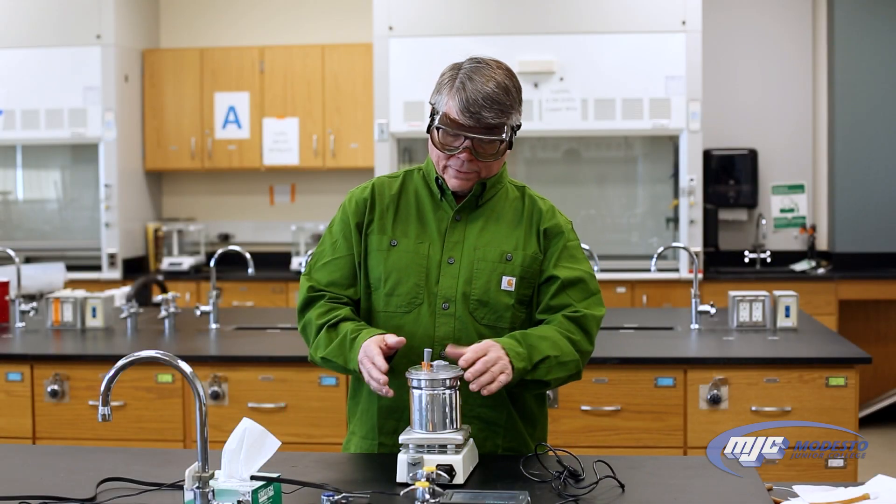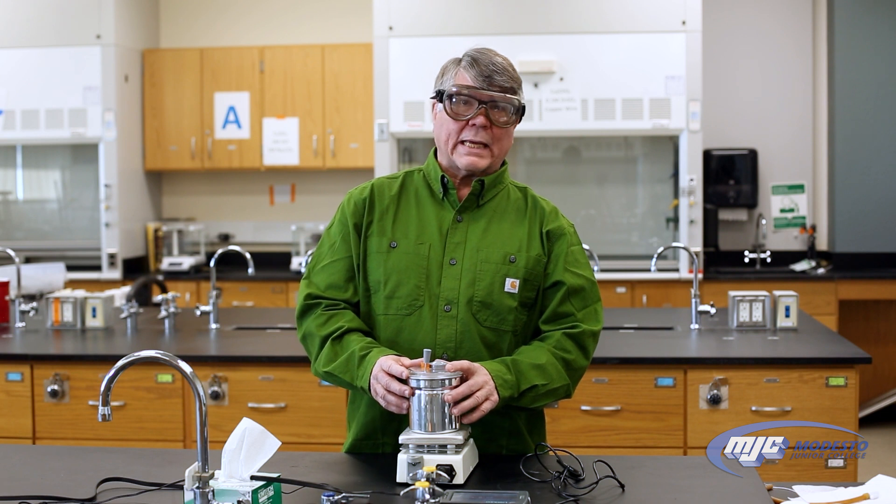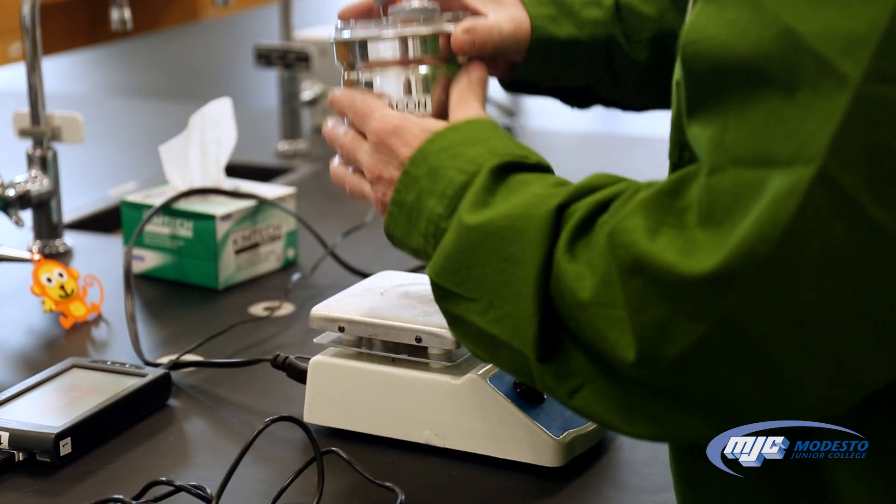Hey guys, this is an explanation of how to use and set up the calorimeter. What it looks like is this — this is the calorimeter.